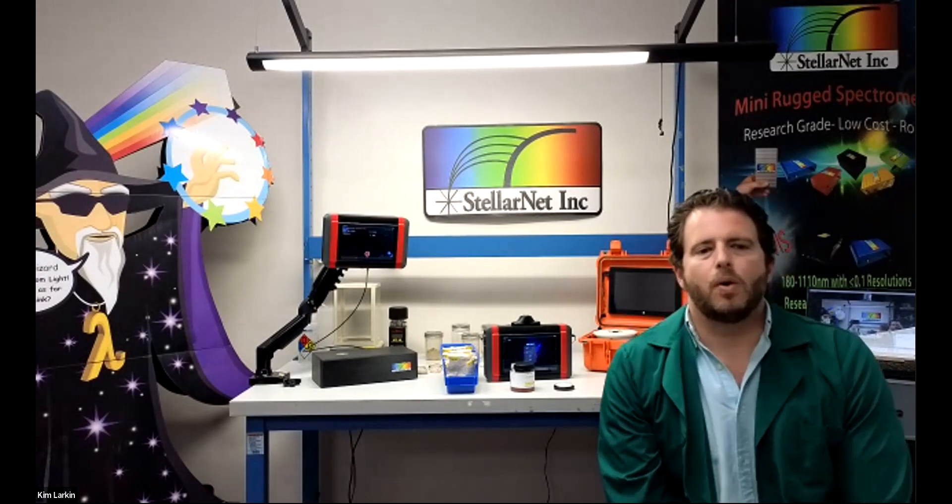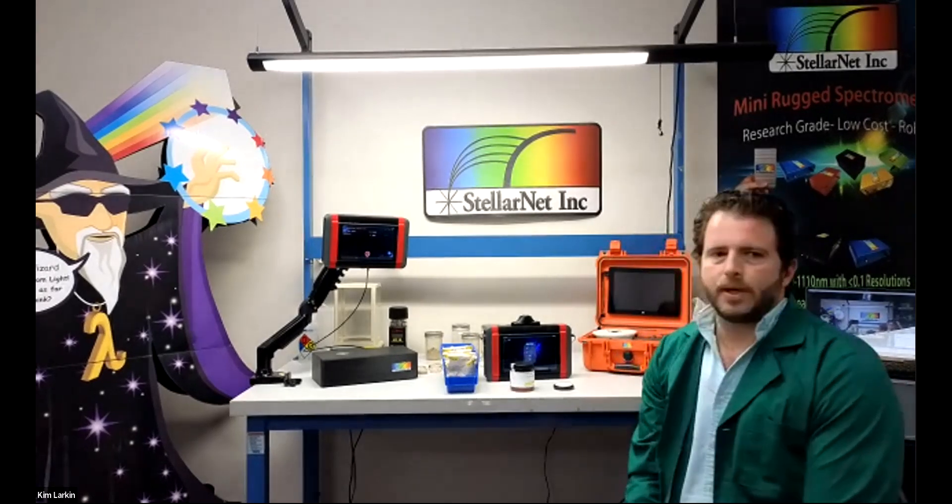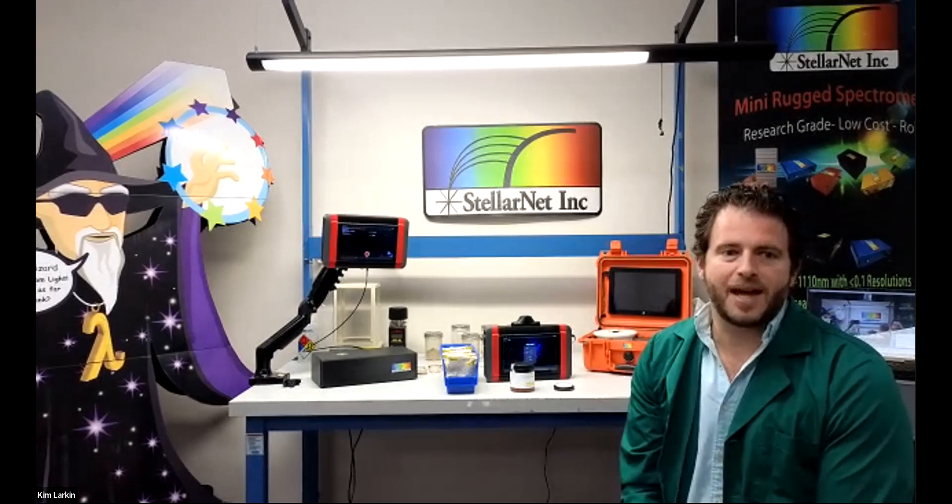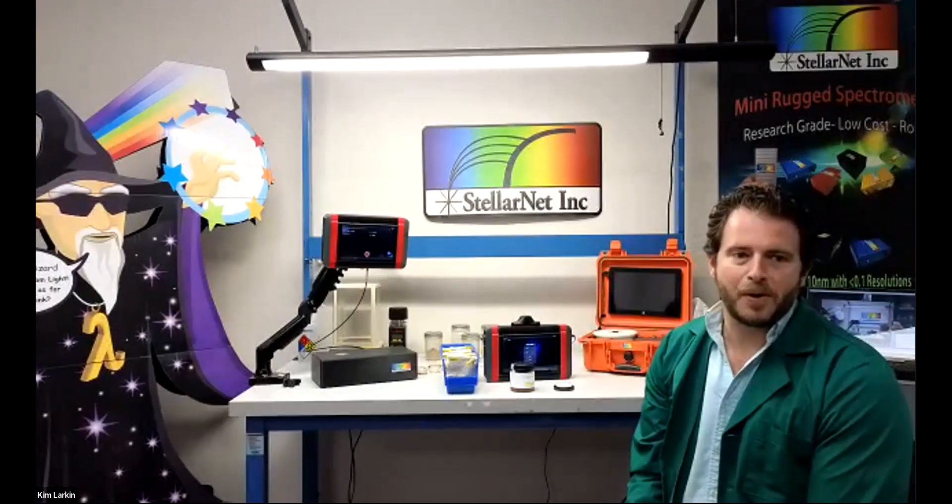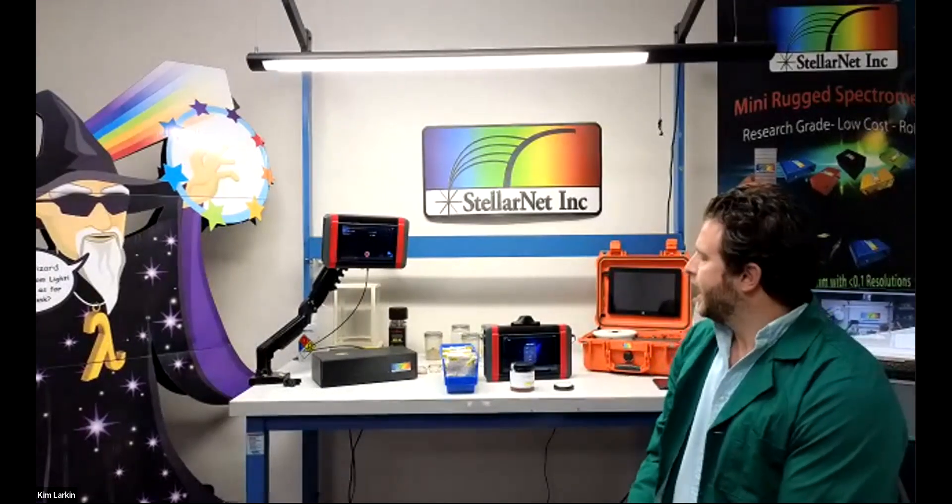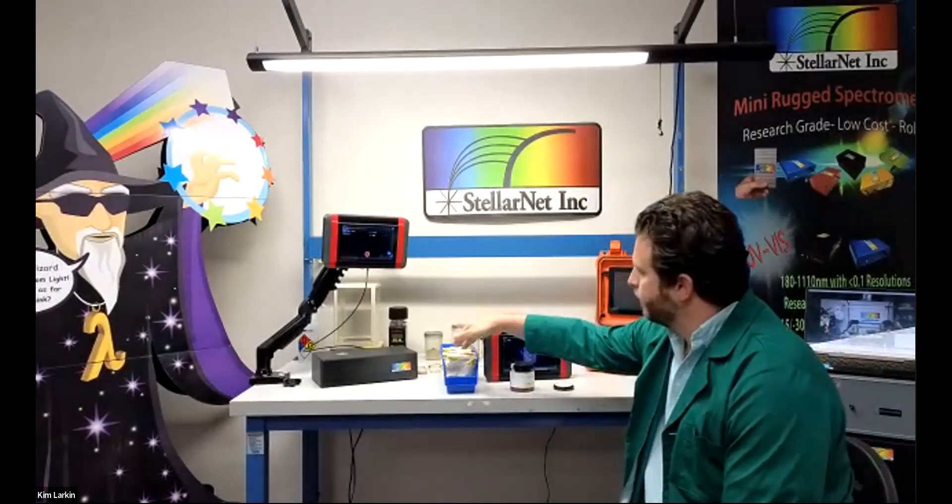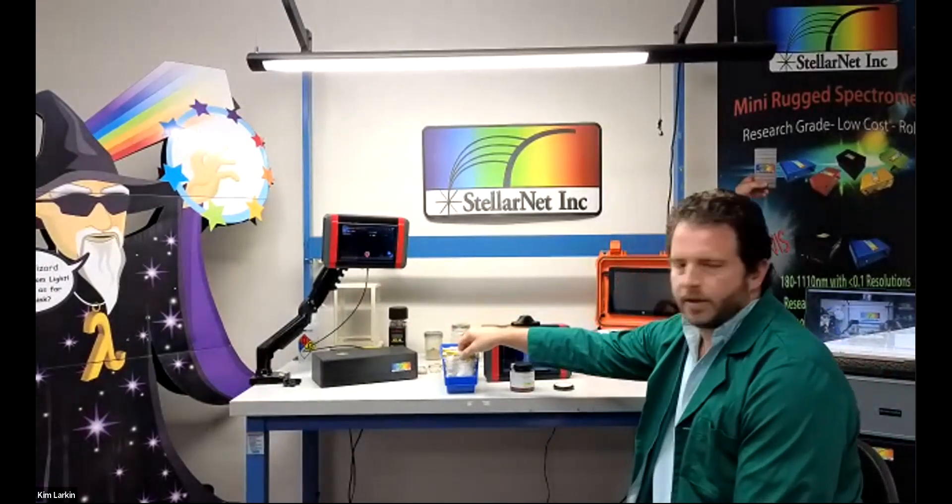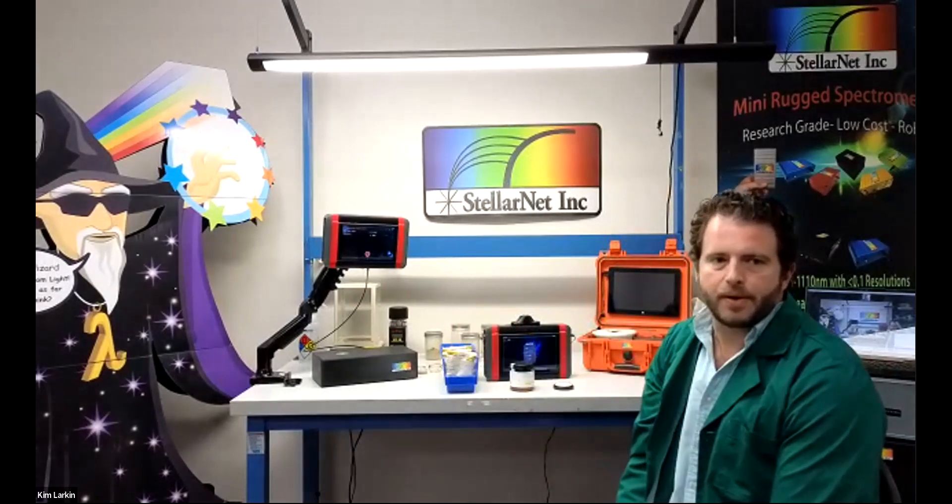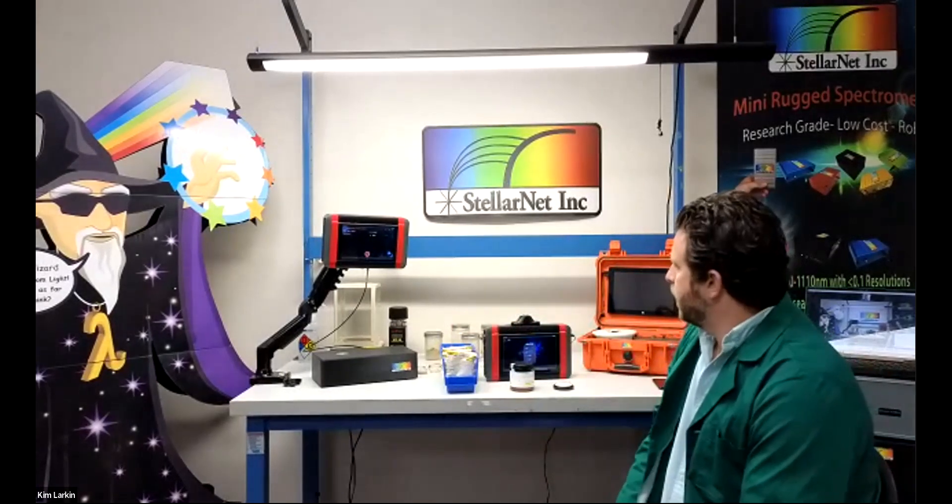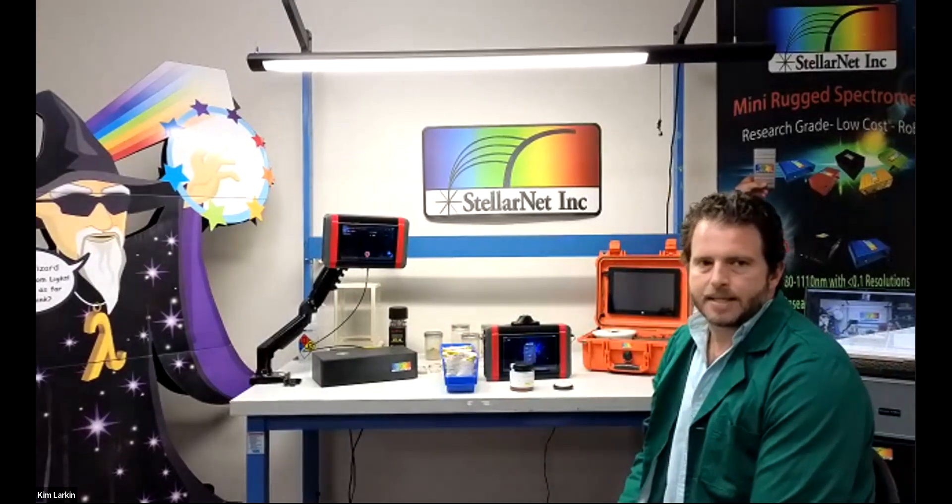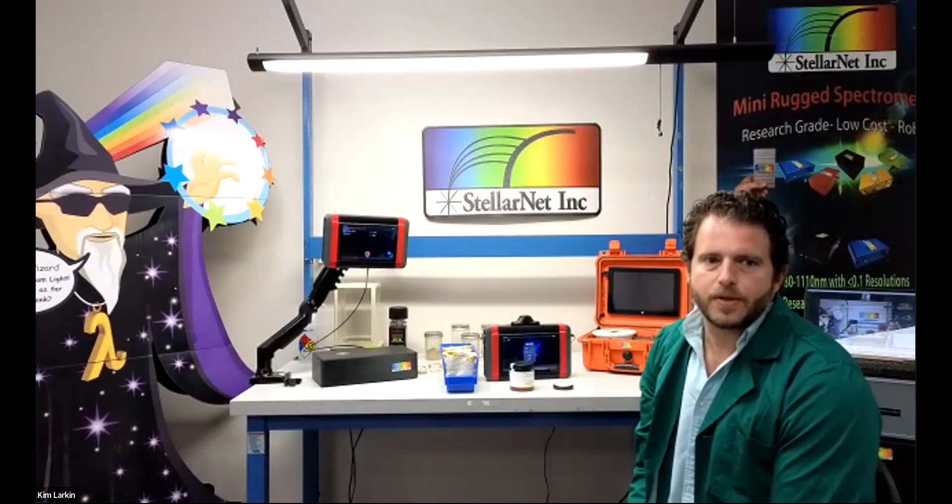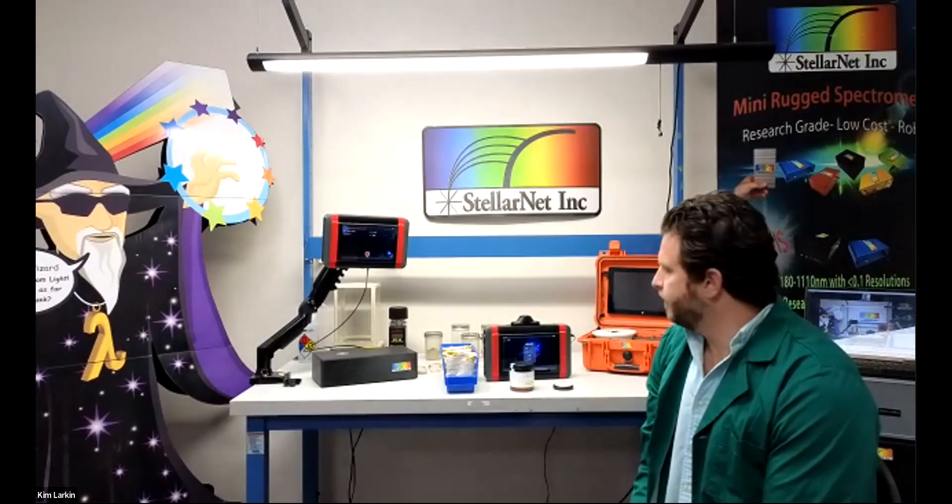So in this demo, I will be doing the similar thing that I did in admin mode. I will be measuring a variety of different nutraceutical raw materials and analyzing it in technician mode so you can see the interface.